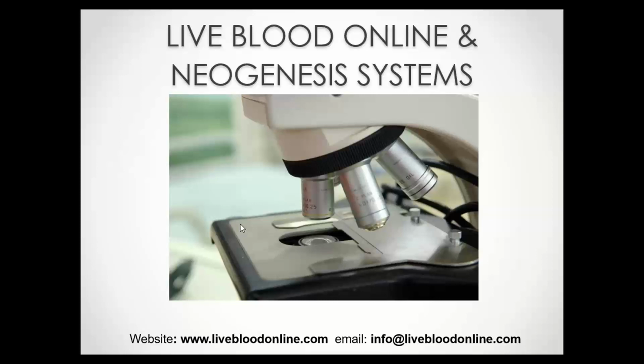Well, the microscope is supplied with a dust cover. As I said, the lenses are sealed, and there's really very little risk of dust getting into any of the essential components, as long as the system isn't disassembled. The areas of the microscope that are exposed, like the bright field and dark field condenser, the little lens at the base of the microscope where the light comes through, can be easily wiped with a clean, dry cloth to remove the dust. So it really isn't very difficult to manage that situation.